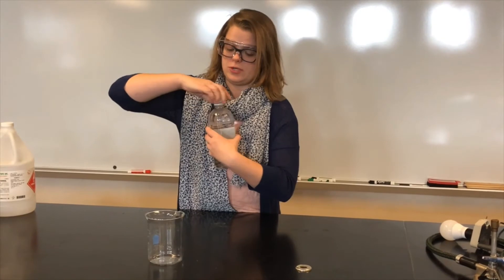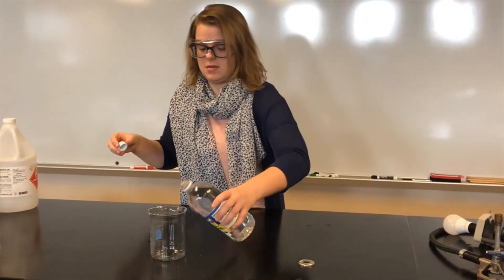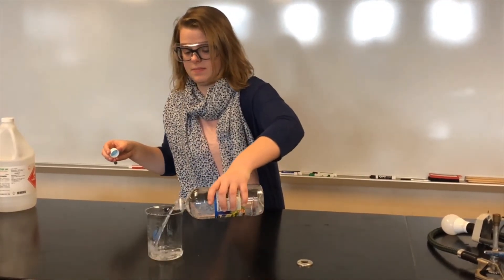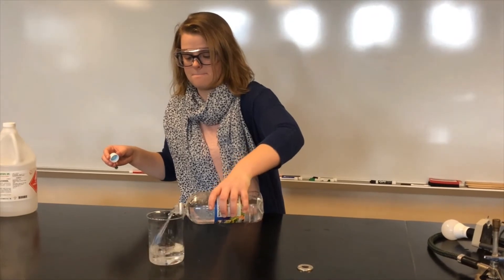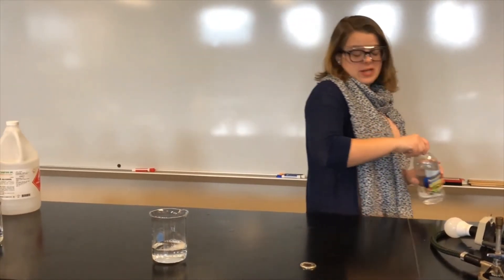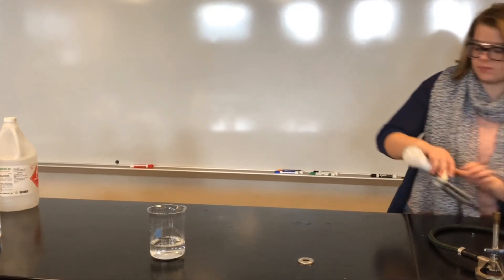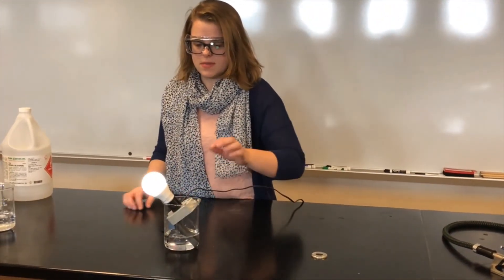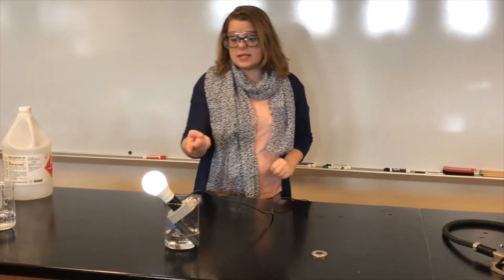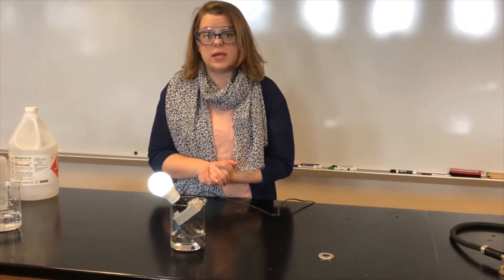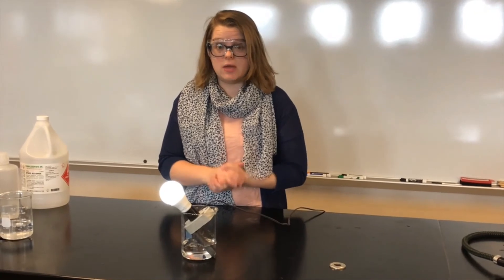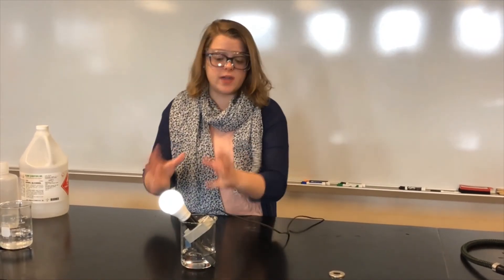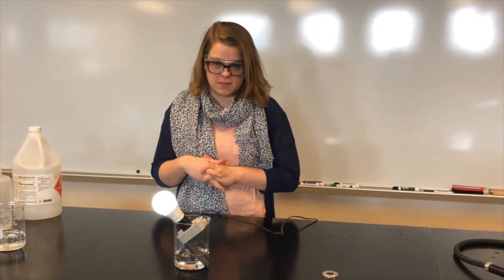So I'm going to go ahead and pour some in here, and we're going to see what type of electrolyte this is. As you can see, it lights up — but if you look at the light bulb compared to when we used hydrochloric acid, it was extremely bright. This one is very dim. Yes, it produces ions, but not a lot. That's why it's a weak electric current and a weak light being emitted.